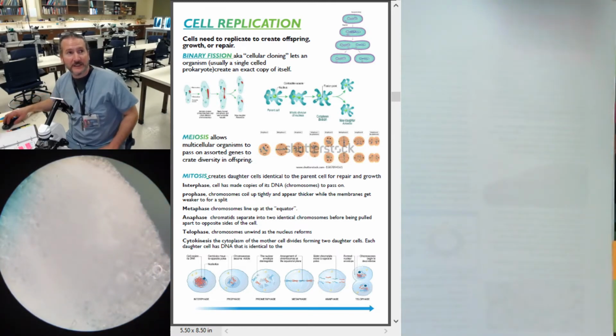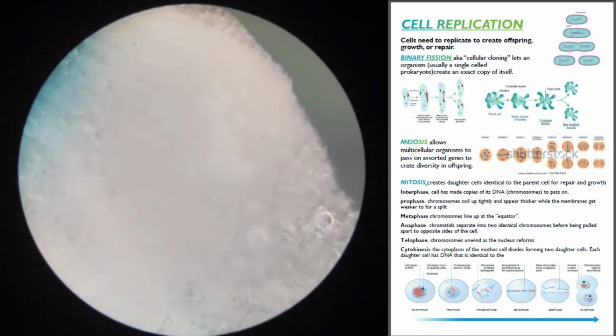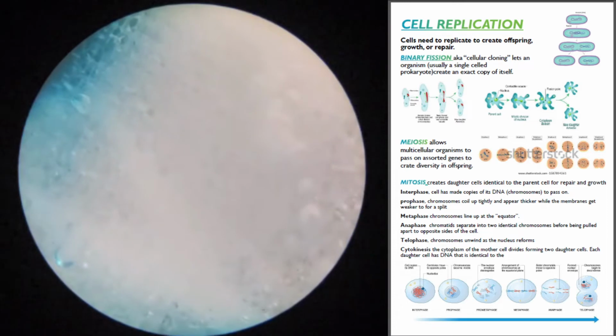Just kind of flushed it. It's creeping along, slowly but surely. I'm going to go over and look a little bit. I can wait. I'm just going to look right at those cells.